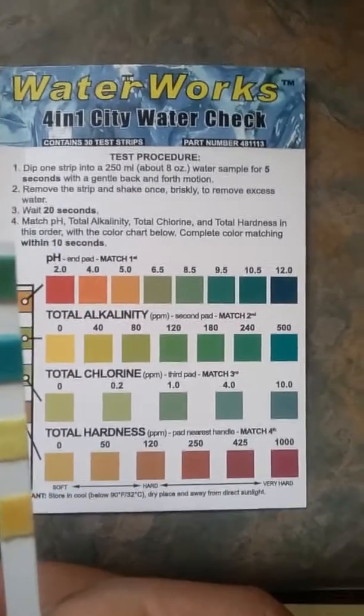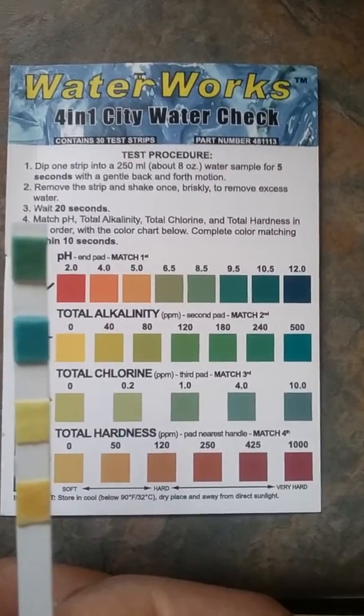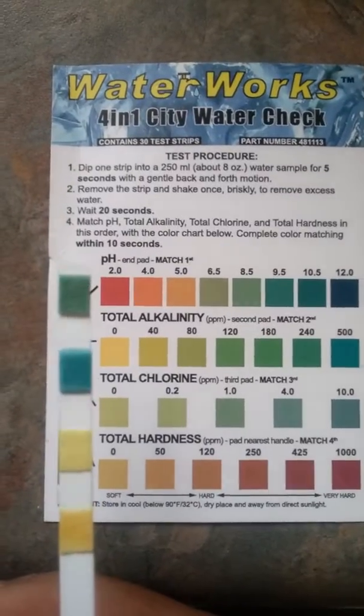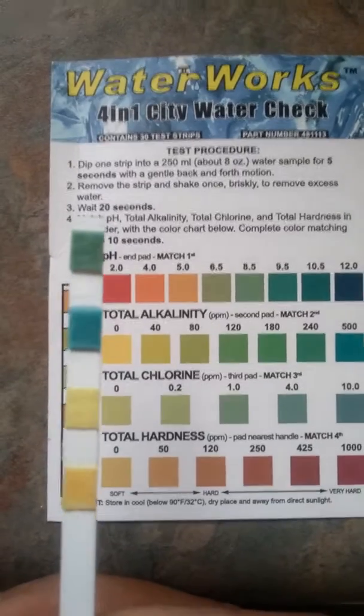Anything a person would need to know about their water, they can use these strips. You can go online and get them — WaterWorks 4-in-1 City Water Check. You can find them on Amazon or eBay.